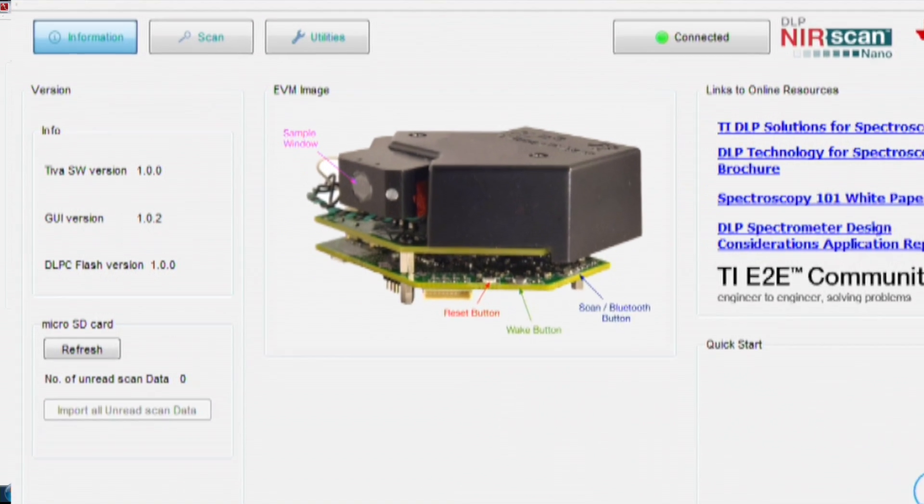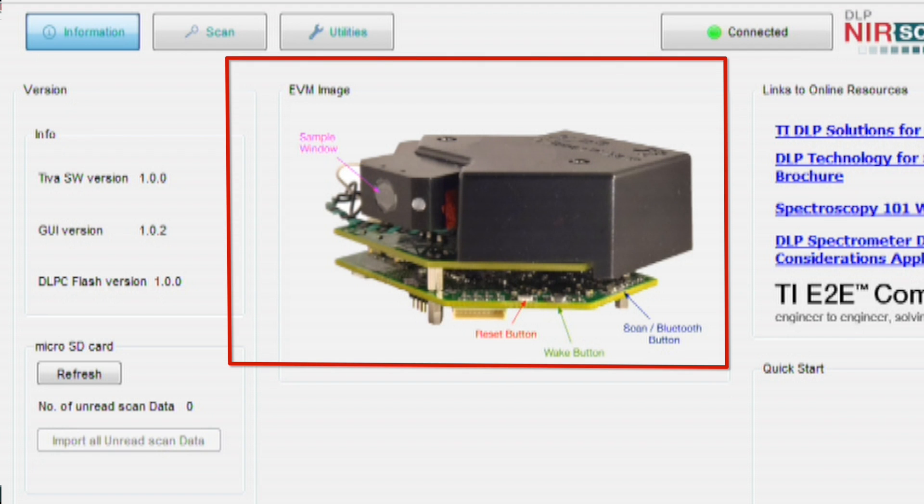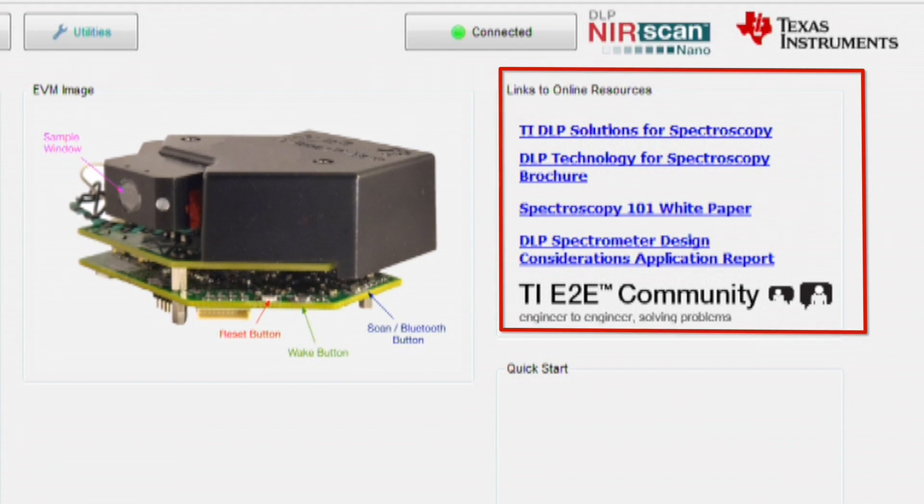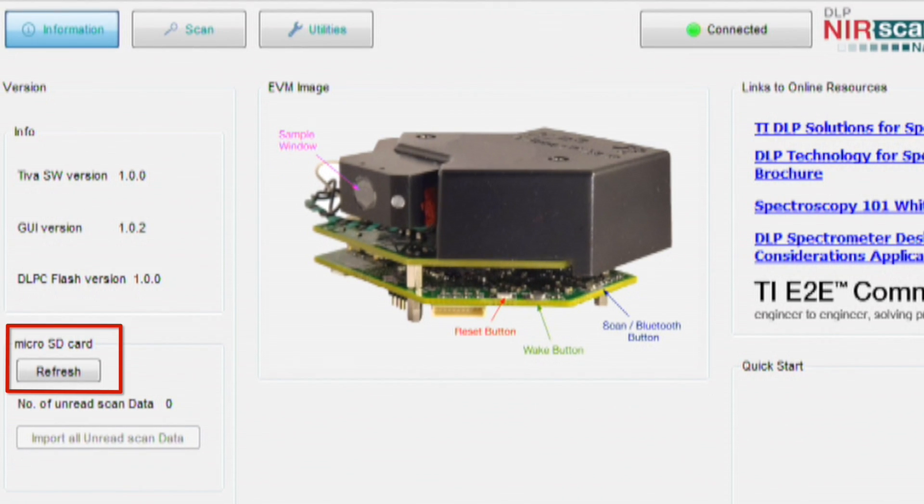The information screen displays version information, the EVM image showing the location of the buttons and their functionality, links to online resources, and presence of micro SD card for importing scan data to the PC.